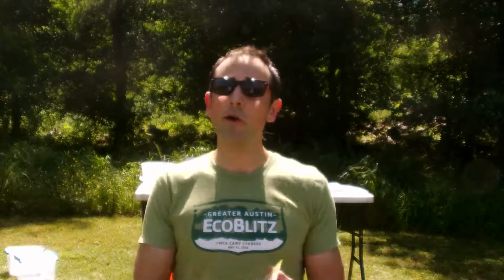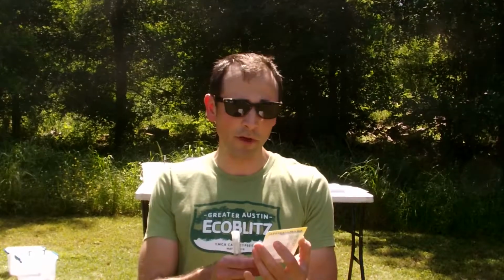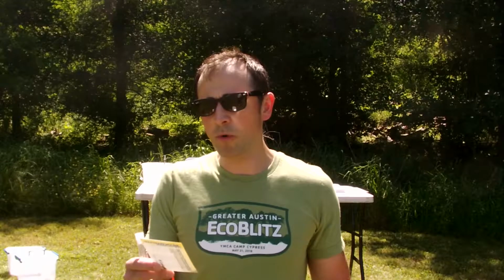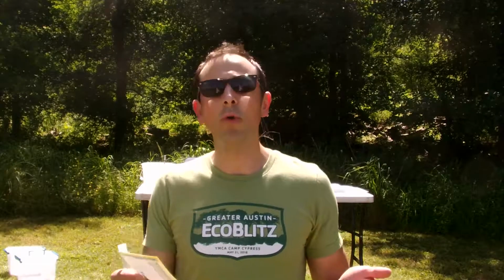Everybody, coming back to you with the ammonia test. So, ammonia, what exactly is ammonia? Well, you've got your handy dandy card here that you'll have. The kids will also have a copy as well. So ammonia is present in any water source, pretty much. The primary sources of ammonia in water are bacterial decomposition of organic waste, okay, and excretions from aquatic animals. Ammonia serves as a source of nitrogen, which is used as a nutrient for the growth of aquatic plants.